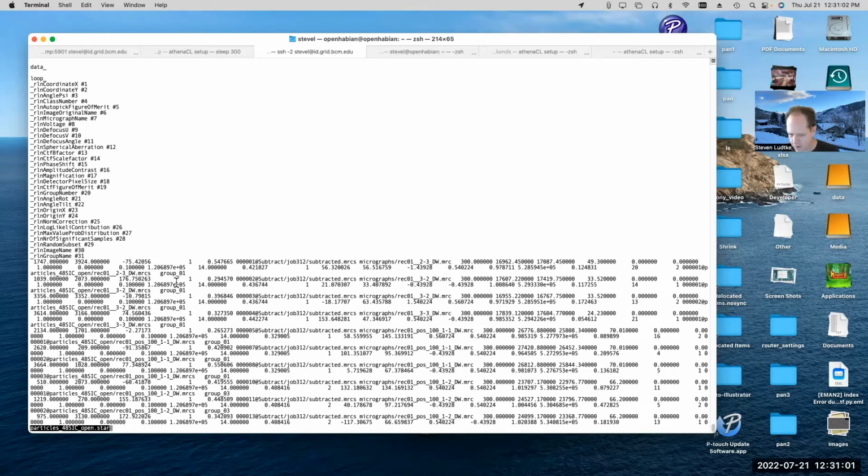So most programs that do stuff with star files will actually read the entire star file into memory, and then you can immediately jump to any entry, so they reformat the information in the memory of the computer. But of course, if you have 2 million particles and 30 parameters for each particle, now you're talking about like 100 megabytes occupied with just this star file representation.